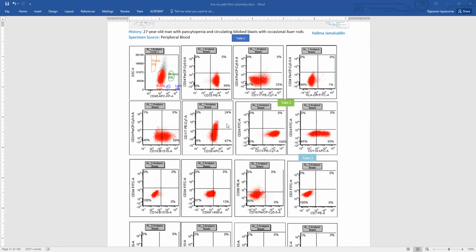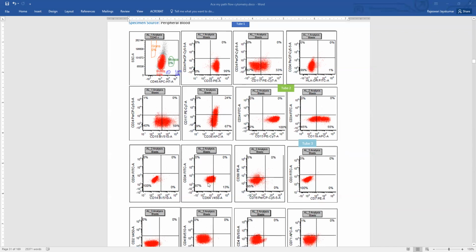And if you remember, the myelocyte stage starts gaining CD11b. So promyelocytes usually are negative for CD11b, but then they can start acquiring CD11b and CD15, and they're positive for CD38. CD64 again can be positive in some of the myeloid precursors, so you can have a bit of CD64 or partial CD64 expression in APLs also.